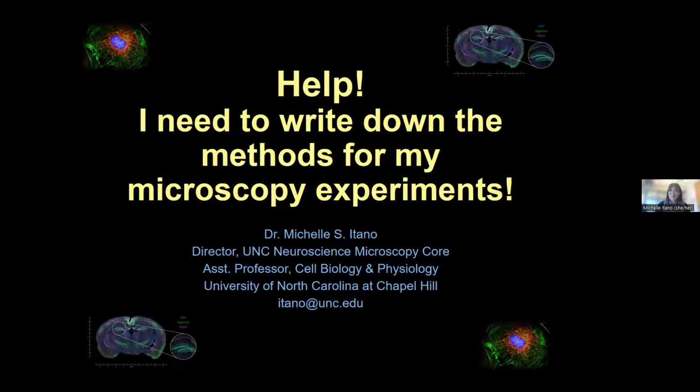So today what I was going to talk to you about was that moment right when you're about to submit, or maybe when you're looking at proofs and you realize you need to write down the methods for your microscopy experiments. And some of these, unfortunately or fortunately, may have happened quite a while ago. Some of them will be quite recent and undergone a lot of change. So we're addressing that issue, that help. How can you get help from the imaging scientists around you? And what are we doing as a community to help support this?